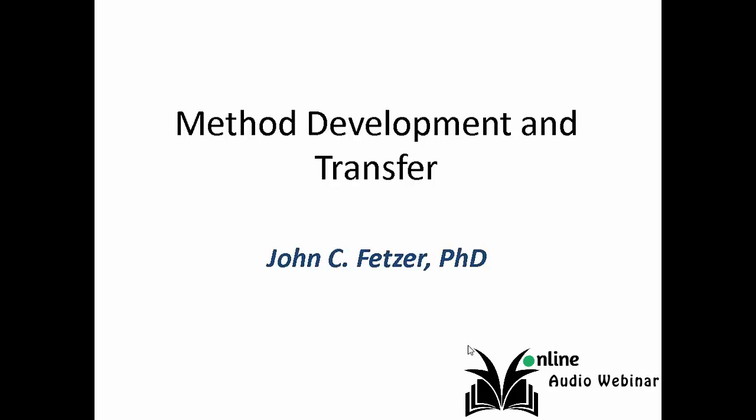Over to you, John. Good day, everyone. Today's topic is on method validation and transfer under good laboratory practices. It covers a wide-ranging variety of topics. The intent was that if there were problems at any manufacturing facility of whatever kind, the product should be interchangeable.